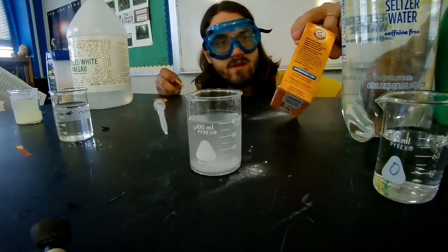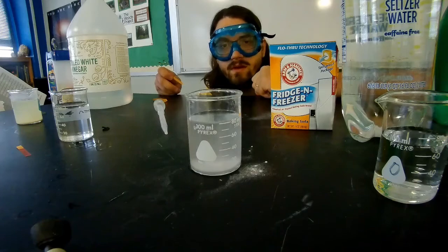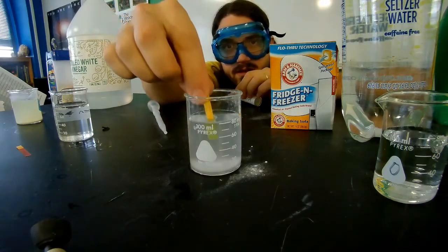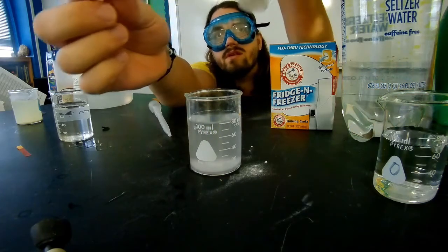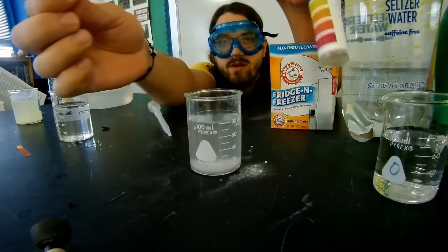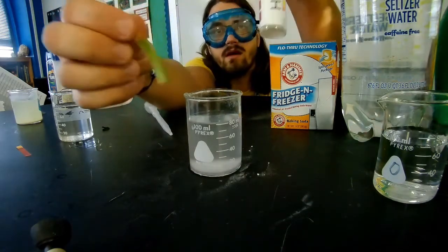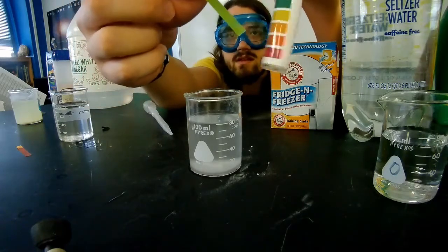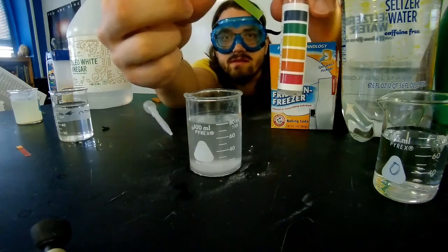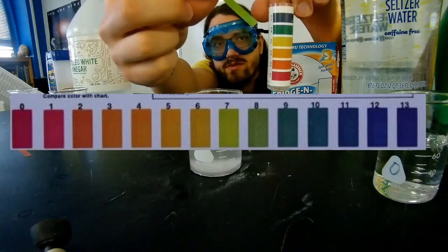All right, now on to our next substance, the baking soda. Let's see how we're doing here. I'm going to dunk. All right, pretty clear chemical change there. So that's an initial reading. Let's wait for a second and see if this dries up and changes anymore. All right, I think that's about as dry as it's going to get. It might have changed a little bit more, but let's see. What do you think? Is this an acid or a base? And what is the pH?